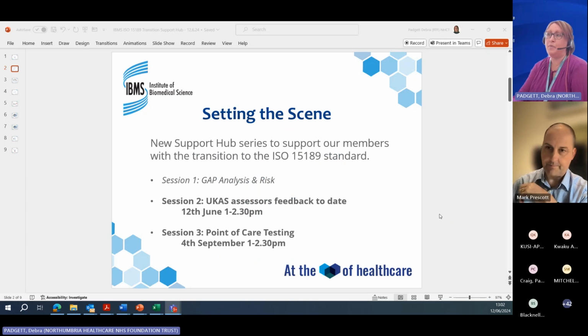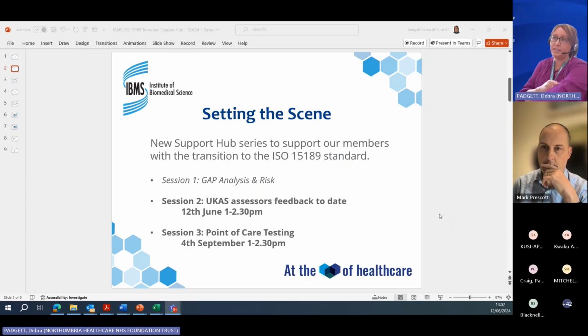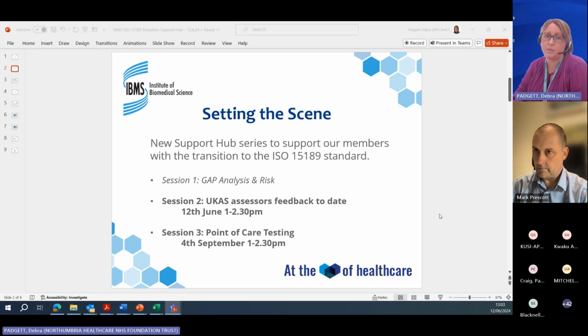Really just to review why we're here today, we have a series of 3 sessions with the support of colleagues at UKAS to help our members go through that process of transitioning to the 2022 version of 15189. The Support Hub started a couple of months ago when we hosted our first one with Al Bryant supporting from UKAS and talking us through the gap analysis, and then Nigel Coles, one of my colleagues from Council, talking us through risk and risk-based thinking.